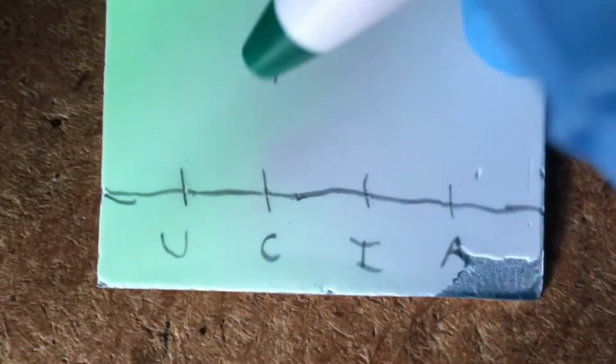So you see some very light markings right about here. Circle them real quick there, and then right on the C there, you can see a light marking right there. And then there's some up there as well, and then just about there. It's very, very light, difficult to see on camera, but I'll make some circles about where they are. And then of course there's also a very, very small one right there. And then we're just going to analyze this like we got good data.